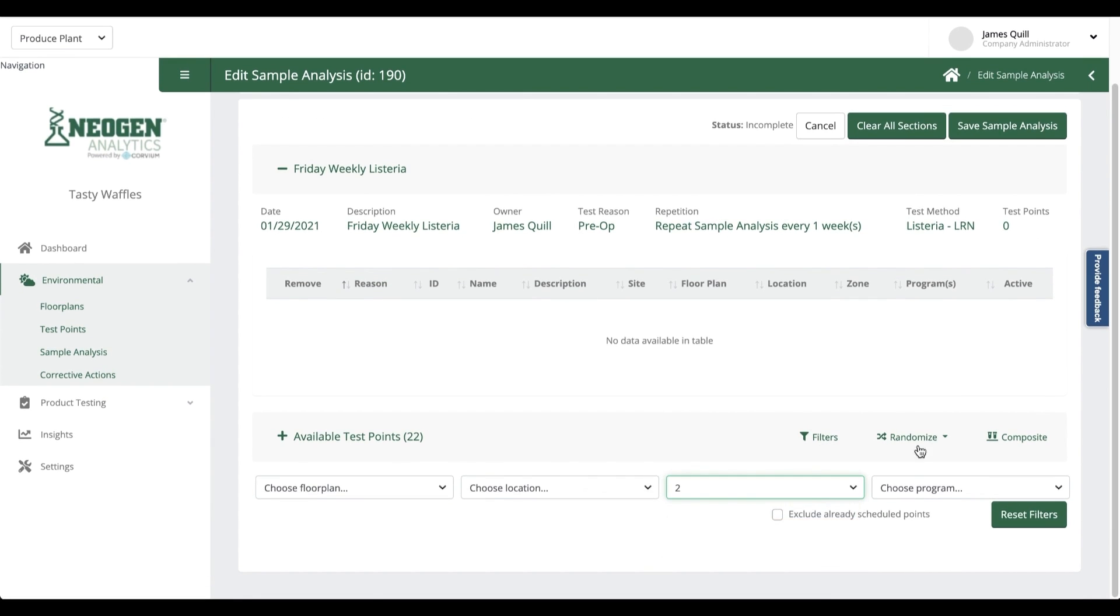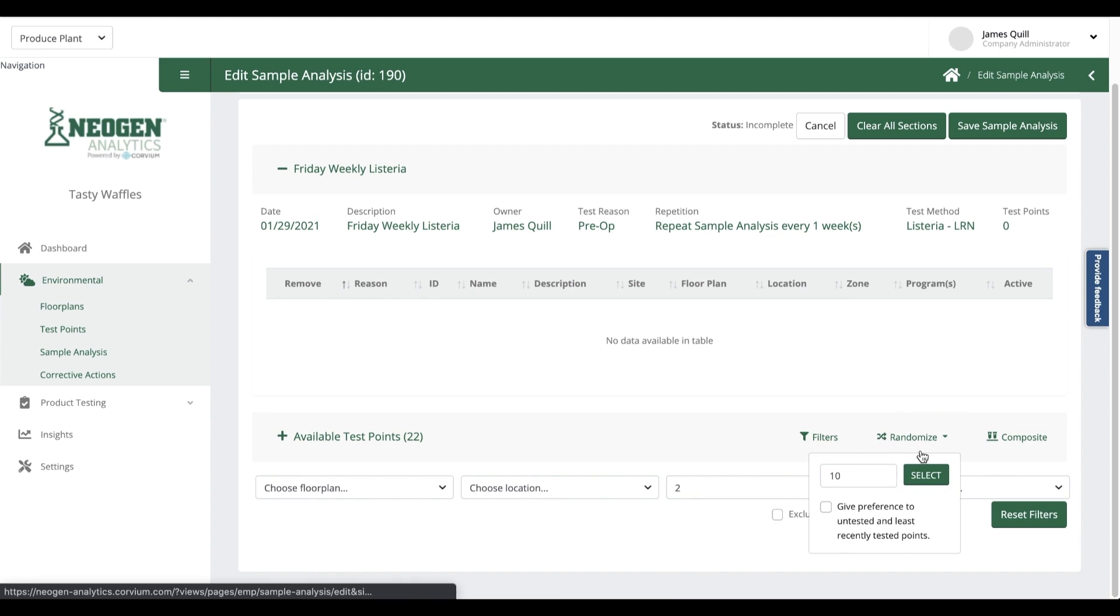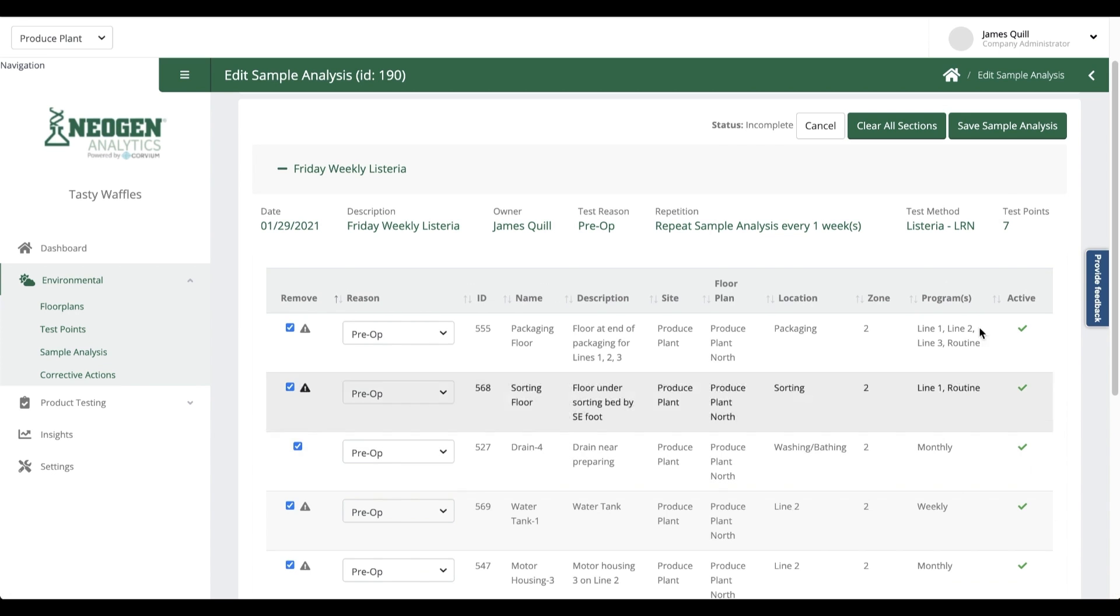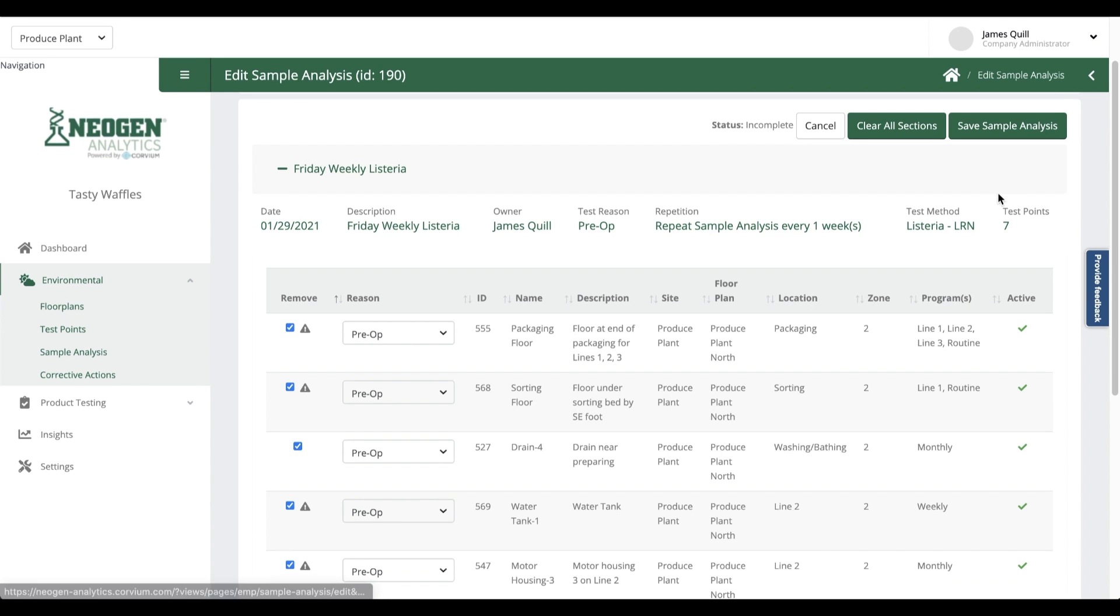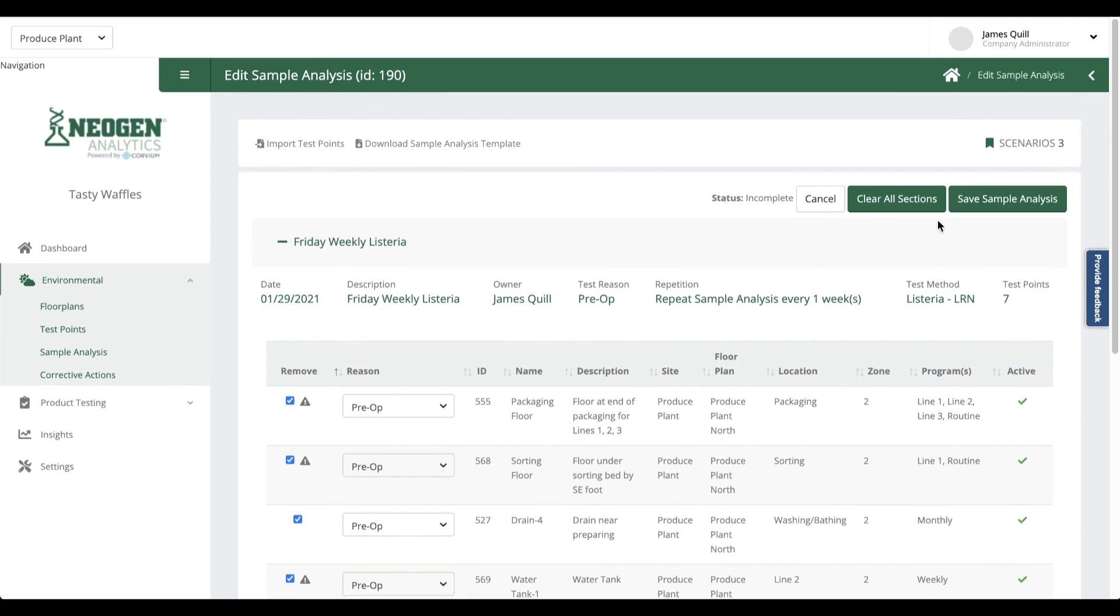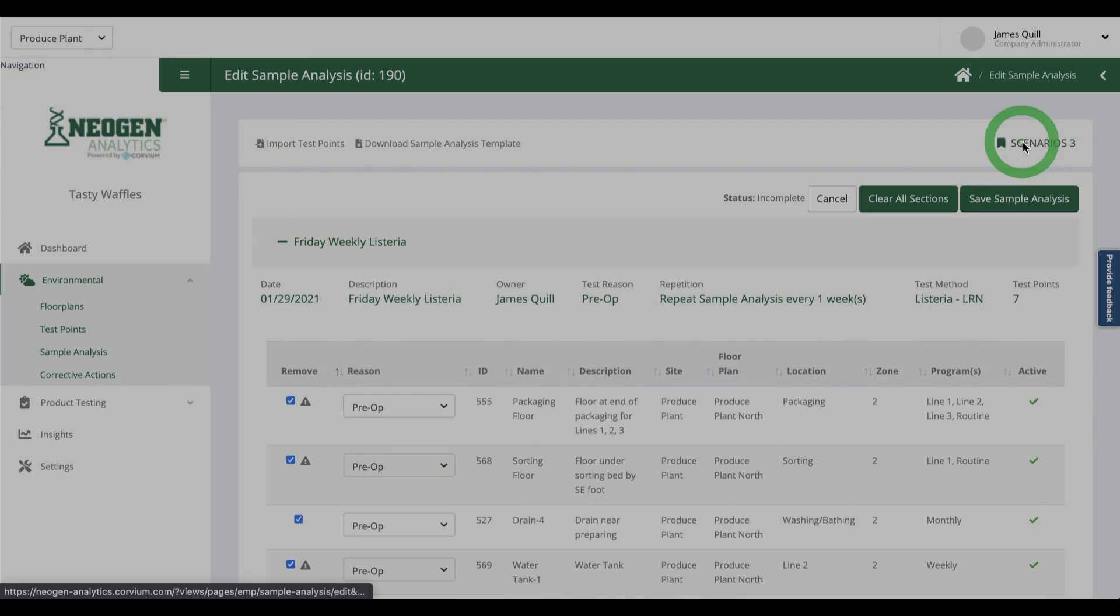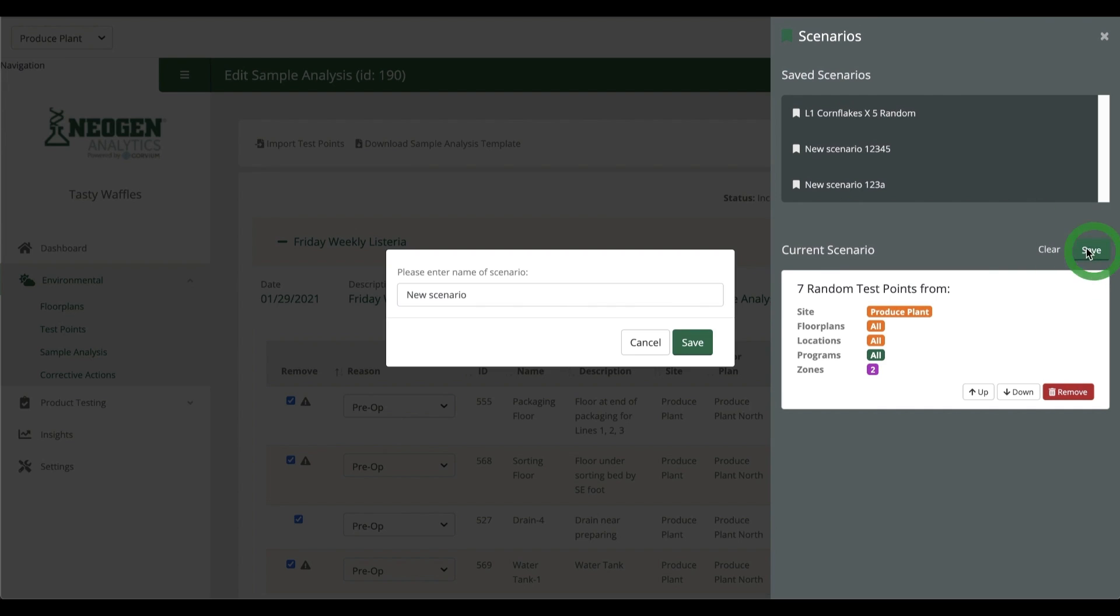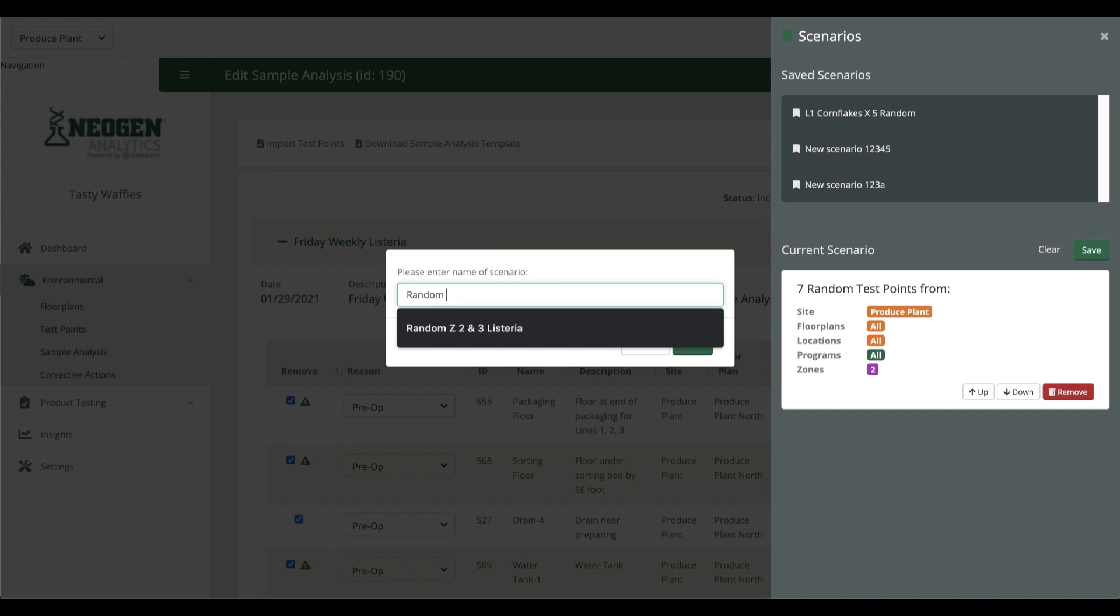Once I have those test points selected, I can see at the top right corner an option to save this particular scenario to be used in the future. I name it accordingly, return to my sample analysis, and save it before moving on to the next one.